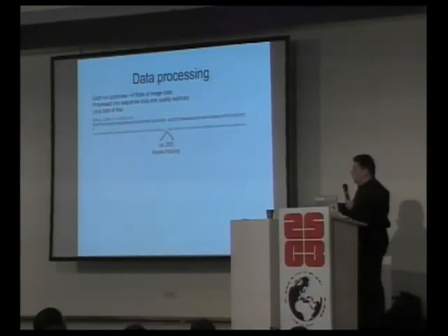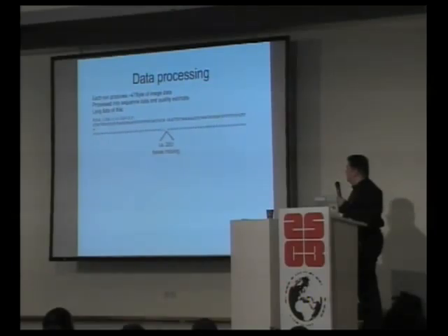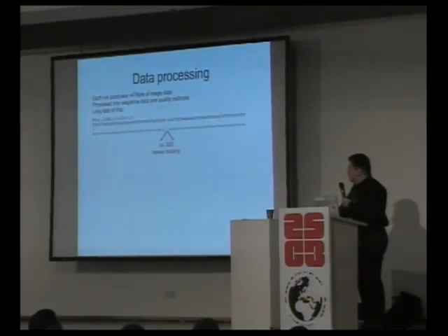And then you have here a quality score, which is ASCII encoded, which basically says, oh, the machine has a certain quality score of how sure the machine is that this is really an A in this case, which is, believe me, not a reliable metric, so it's a best guess.